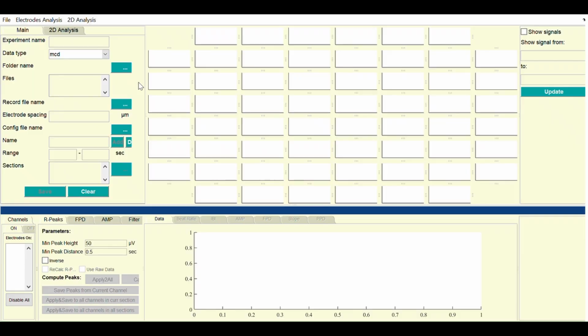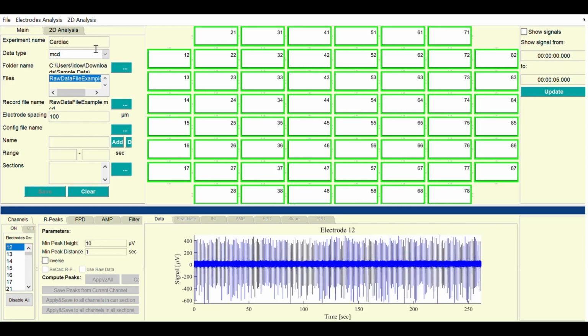After recording the organoid's electrophysiological signals, we move forward to advanced signal processing with PhysioMEA, your gateway to deeper understanding and meaningful discovery. This is the PhysioMEA graphical user interface. Simple, intuitive, and powerful. First, load your data and assign a name to your analysis project. To plot data from all channels on the matrix of figures, which represents the MEA plate, adjust the time range.